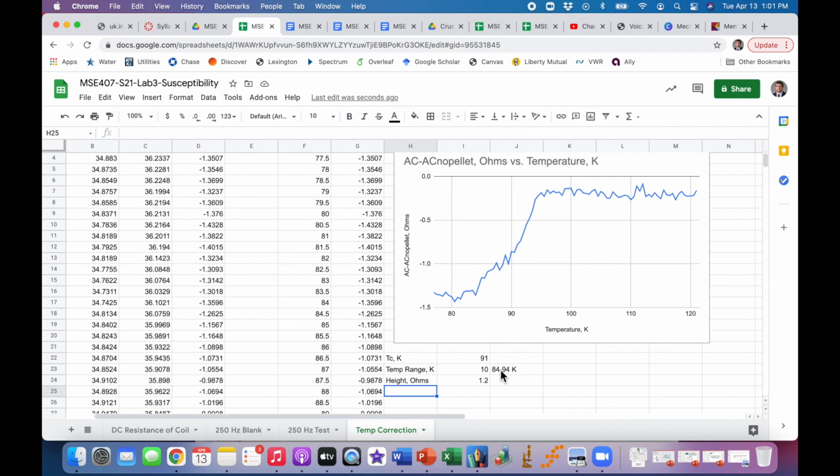So that concludes what I want to show you with susceptibility. These are three quantities that you should be able to calculate for your YBCO pellets that you have made, or we've made, in this lab. And so you can compare and see what the trends are with any of these properties with the different conditions that we've done.